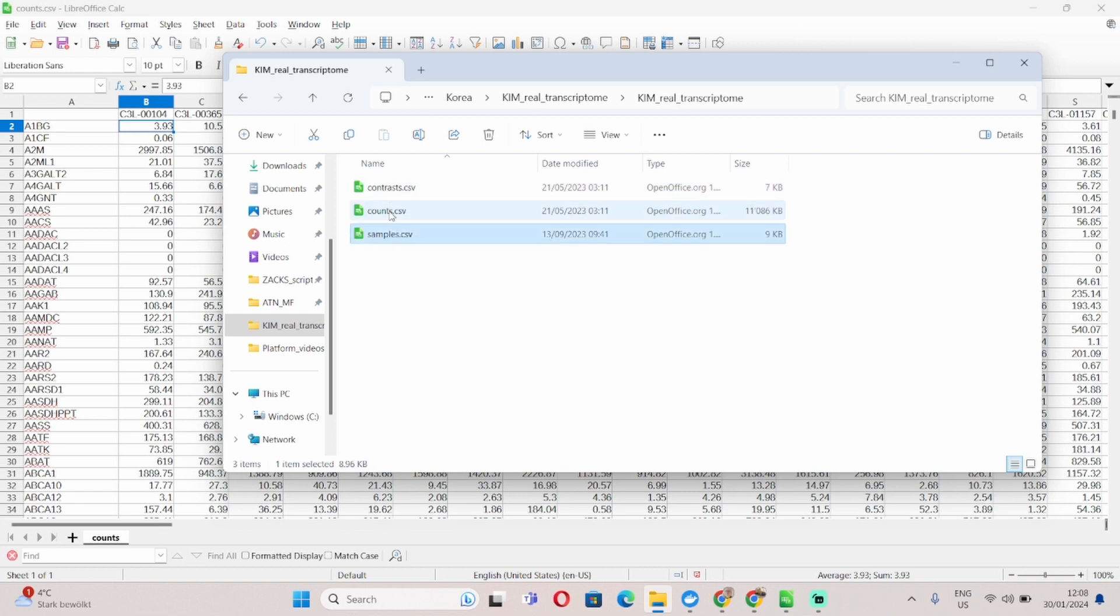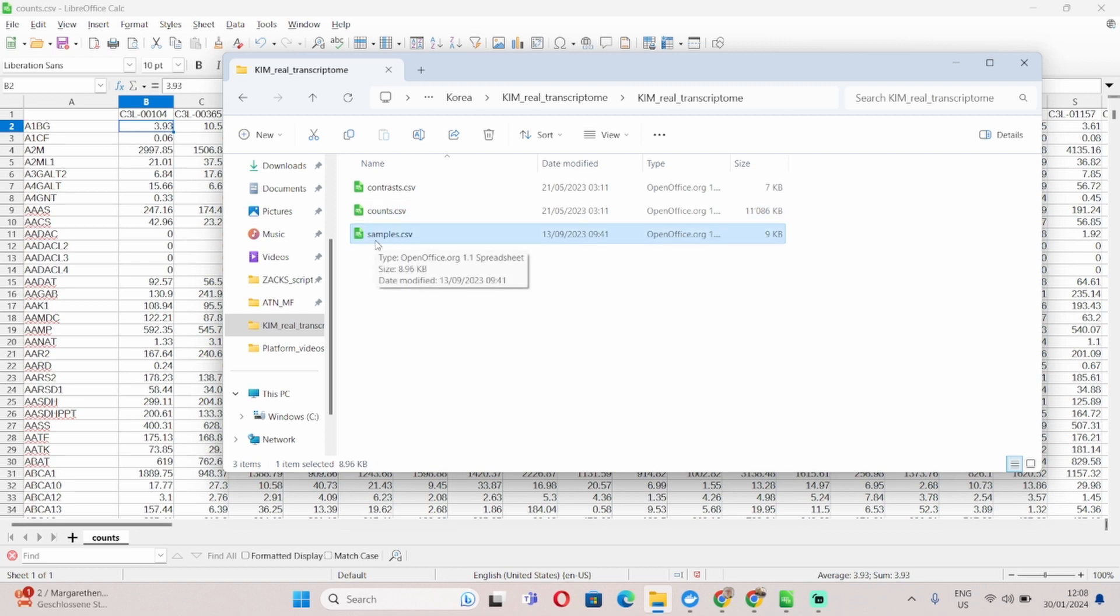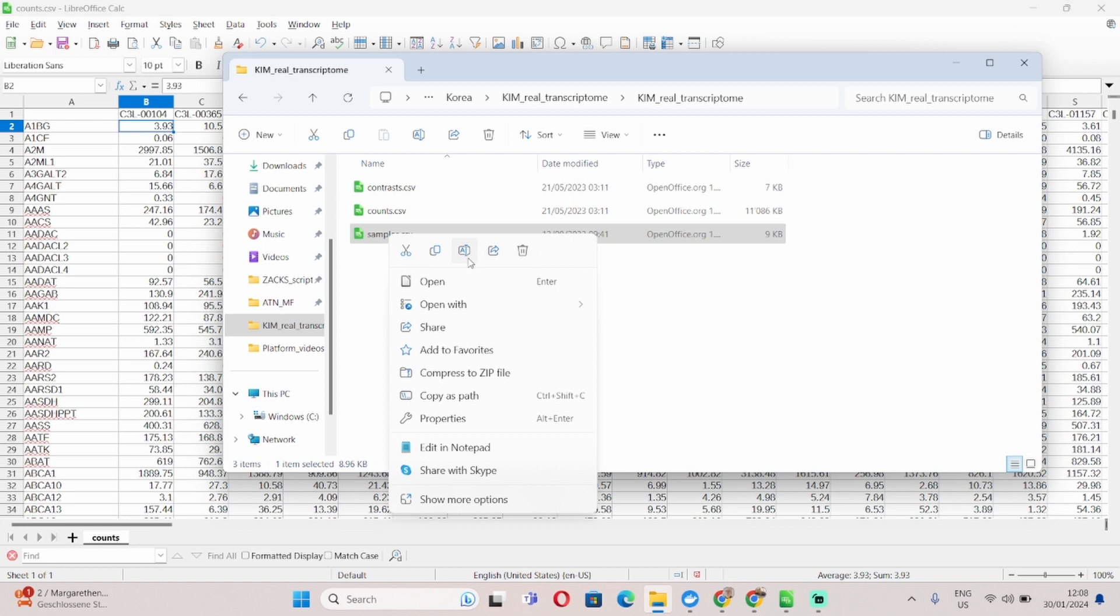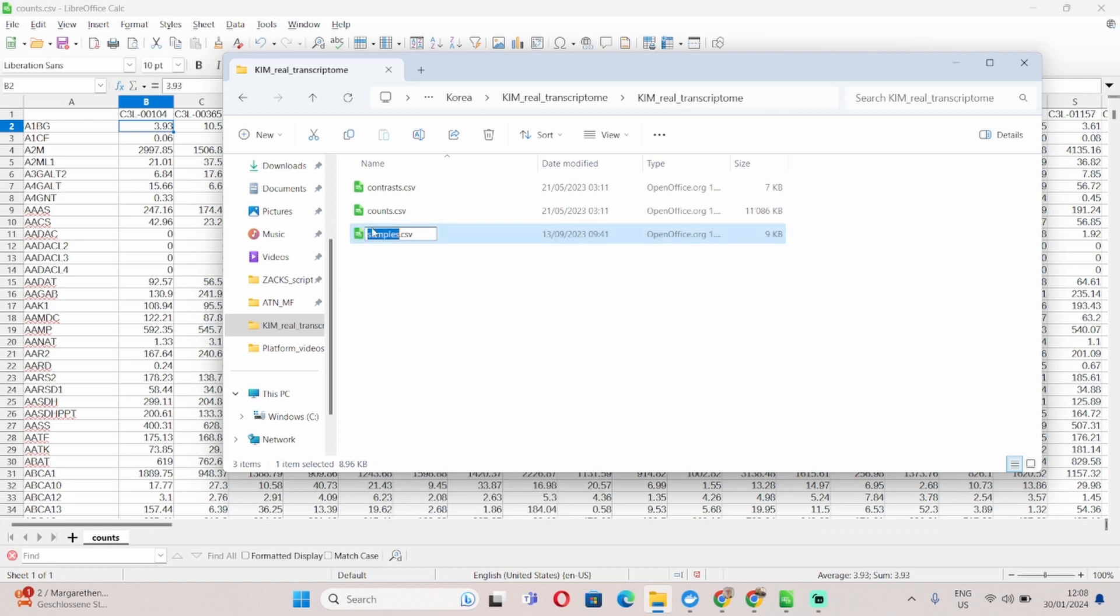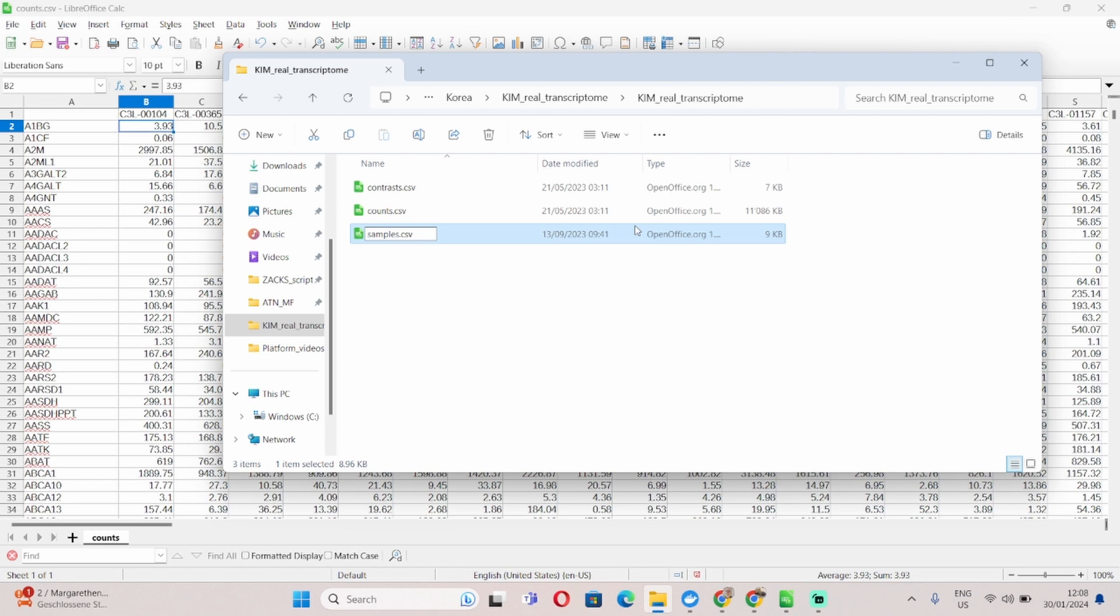This however you need to prepare yourself. Now when it comes to the naming you can really pick any name you want as long as each of the files contains the words samples, counts and contrasts in them. So for example if you want to rename this to be more specific you can say cancer but it has to contain the word samples in it and the same goes for counts.